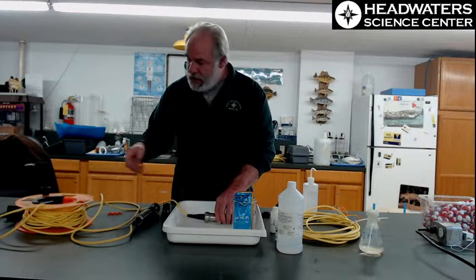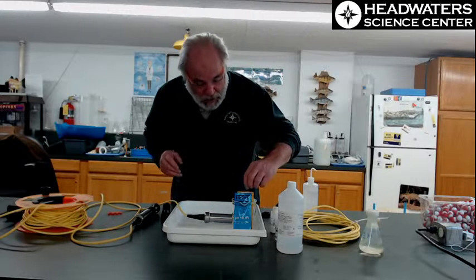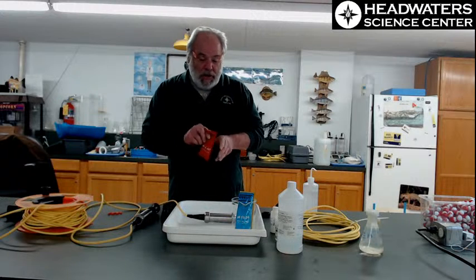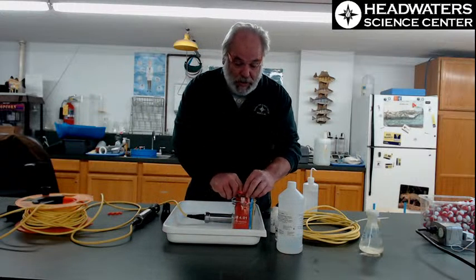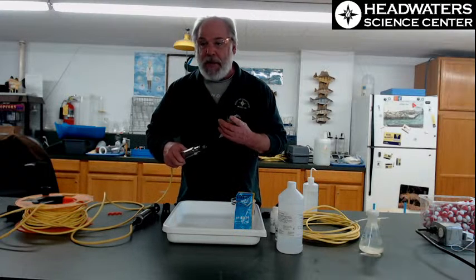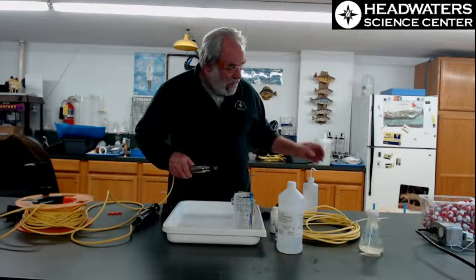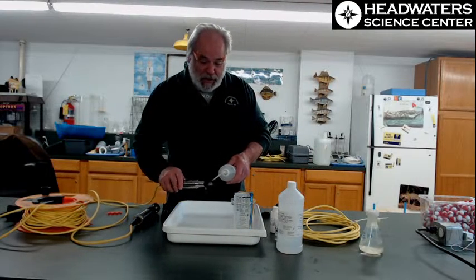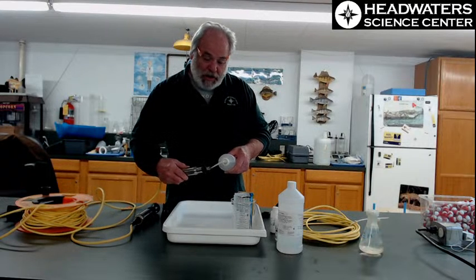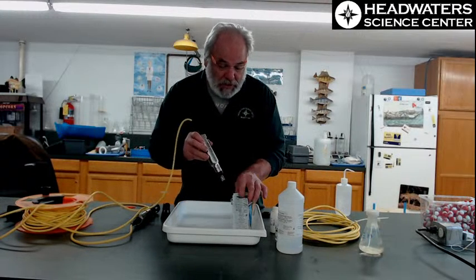So let's look at how we can find out two things at once when we start to do our analysis. We can find out how well we did the last time out, and we can get ourselves ready to do it well again the next time. Now, I do a 3-point check on pH. It's really only necessary to do a 2-point check, but I feel so happy when I get my third calibration in and it measures out well and shows me that yes, your meter does show both accuracy and precision.